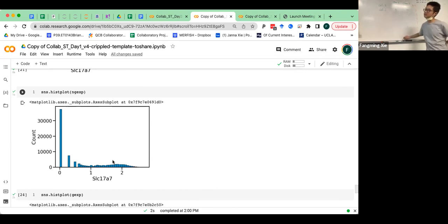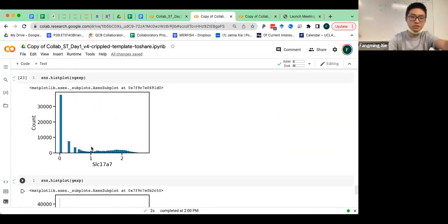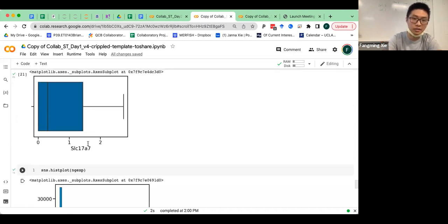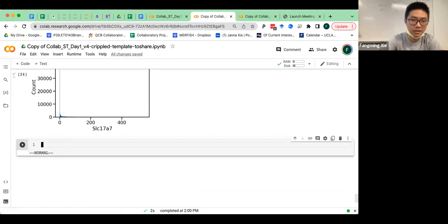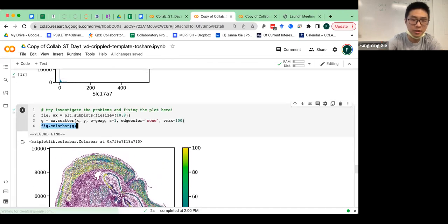So do you want to measure the differences between cells by fold change or by differences? In many situations, we would argue that fold change is more important, because you could think about all cells sharing some baseline level of gene expression, and different cell types deviate from that baseline by a little bit. What matters is the concentration of that gene relative to the baseline, and that's arguably measured better in this way. So because of those reasons, it's legitimate to take a log normalization, just keep that in mind. But let's apply it. If we just take log normalized counts and replot it, so just copy this thing.